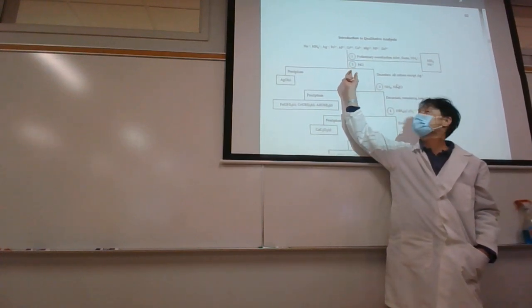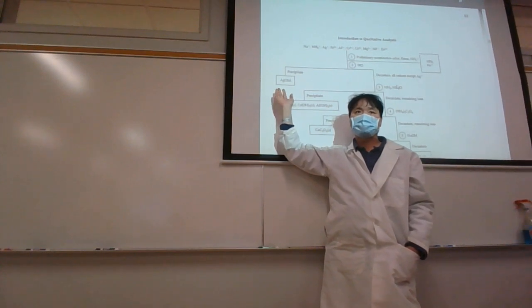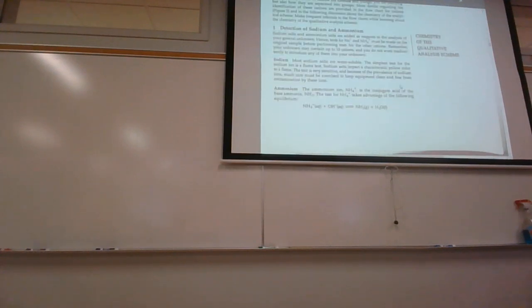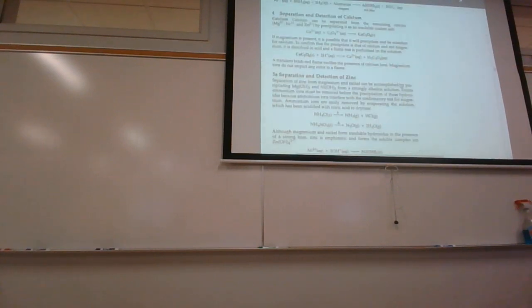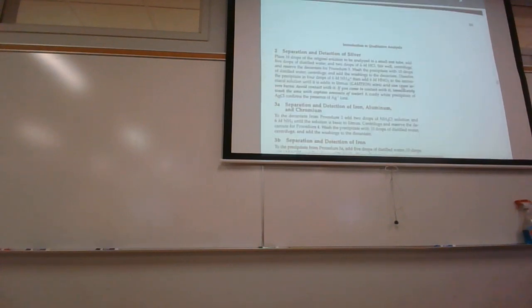We're going to use HCl, and we're going to try to precipitate out all the silver chloride. And so what do I need as far as notebook prep goes? I need to know how much solution I should start with. So I'm going to scroll down here to the procedure and go to number 2.